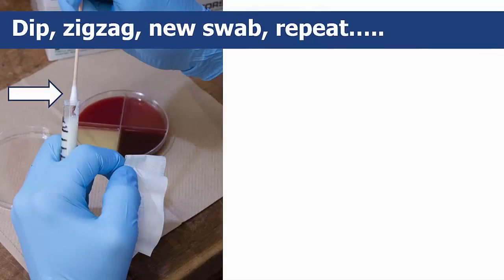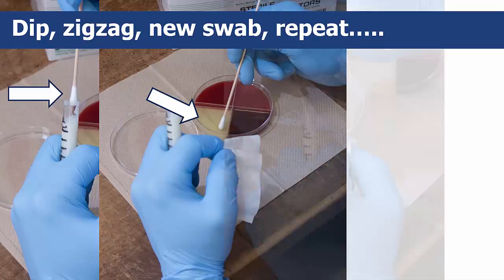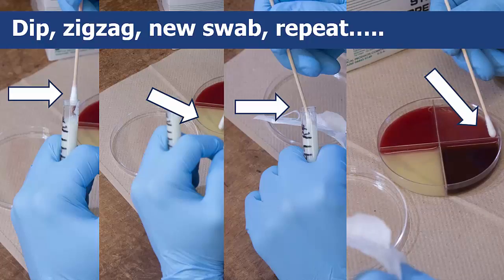After this, dip a sterile swab into the milk tube and use the swab to make a zigzag mark on the first quadrant of the plate. Do not lay the swab down after opening it and don't reuse it. Repeat that process for each quadrant, making sure to use a new swab for each quadrant and zigzag.